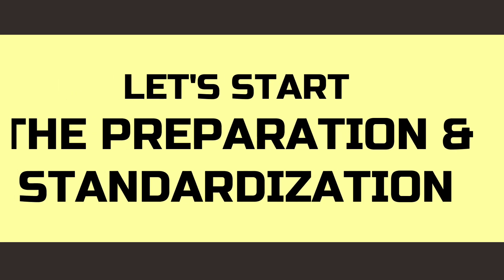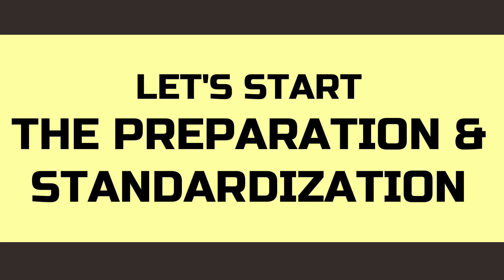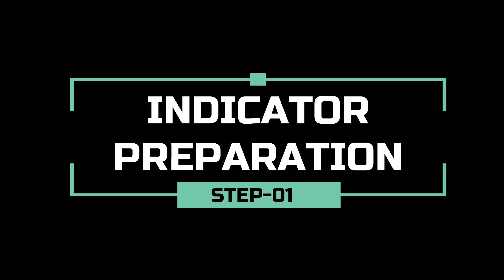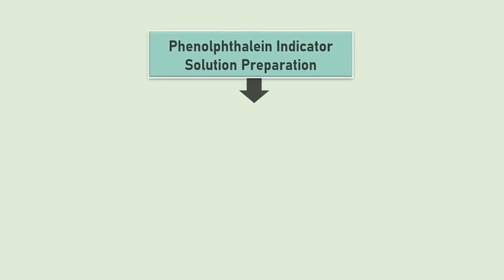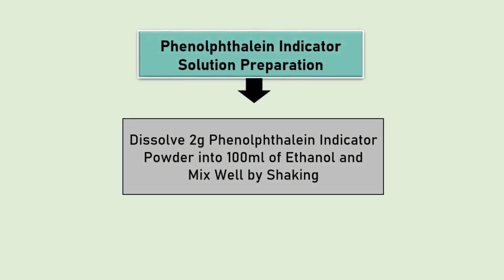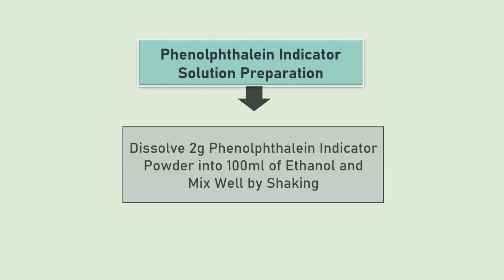Let's start the preparation and standardization of sulfuric acid solution. For the preparation of phenolphthalein indicator solution, dissolve 2 grams phenolphthalein powder into 100 ml ethanol and mix to dissolve.